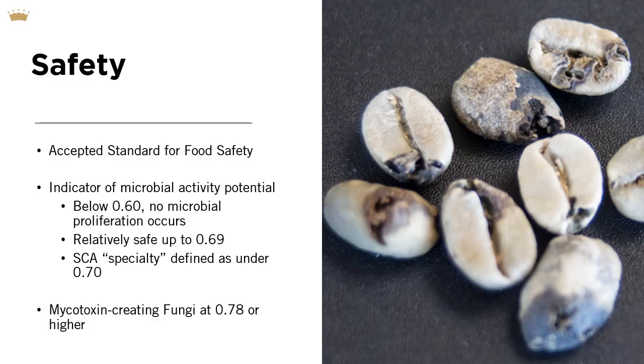Water activity has been an accepted standard for indicating food safety since the middle of the 20th century. William James Scott was able to convincingly prove that water activity measurements can predict microbial growth in 1953. And since that time, the measurement of water activity has replaced the measurement of moisture content in most food products as the primary indicator of potential problems with things like mold, fungi, and bacteria.